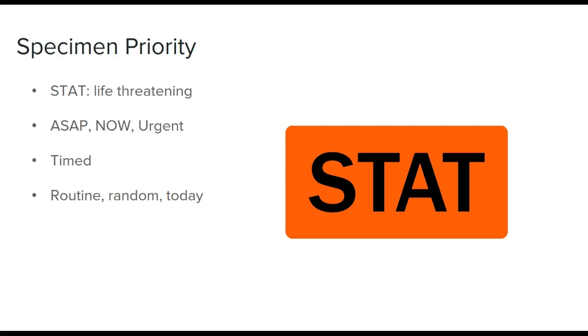Okay, specimen priority. We label and designate certain specimens as stat, urgent, or routine most of the time. Stat, that stands for short turnaround time, and that means that we're going to do that specimen right away. It's at the top of the list.